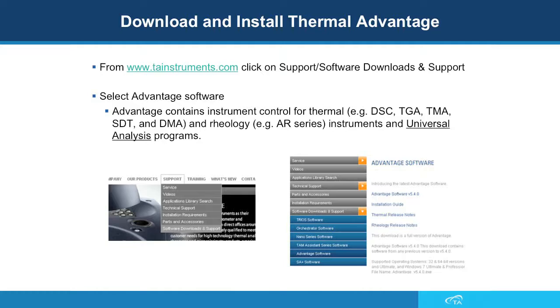This will include instrument control for thermal equipment including DSC, TGA, TMA, SDT, and DMA instruments, but also includes Rheology Advantage, which can control your AR series rheometer. But most importantly for this course, it does also include the Universal Analysis software program that we'll be covering in this course.